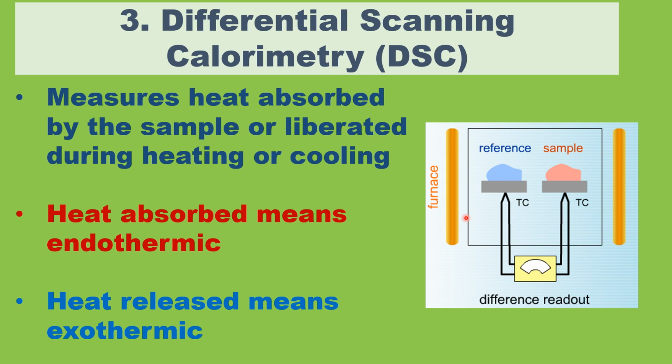So this is the experimental setup. This is the same experimental setup used for DSC also. In DTA and DSC, the experimental setups are the same, because in DSC heat is measured, in DTA temperature is measured.